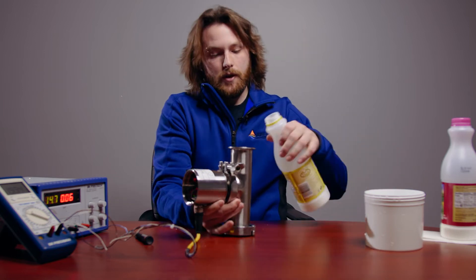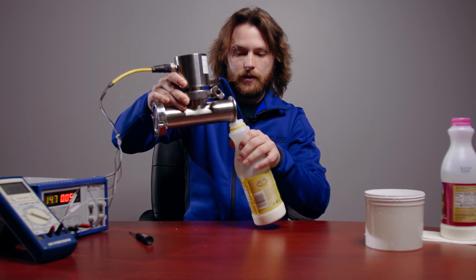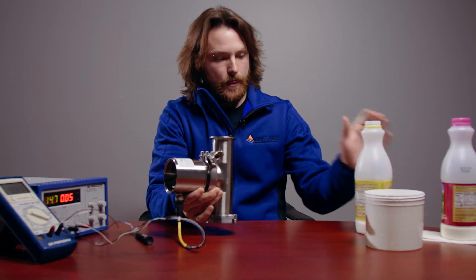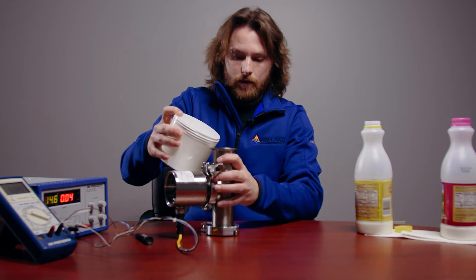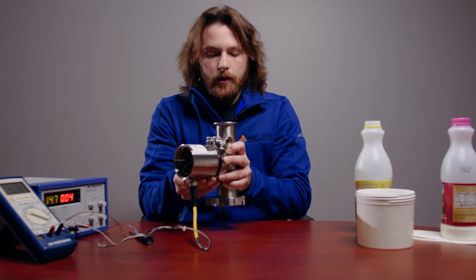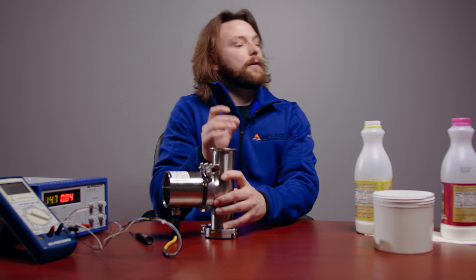In between samples, you may want to use water to rinse out your tee in order to get a little bit better results. Swish it around in there, then pour it right back out.